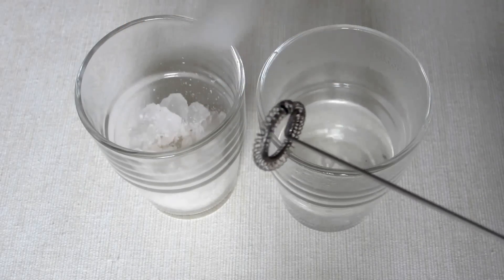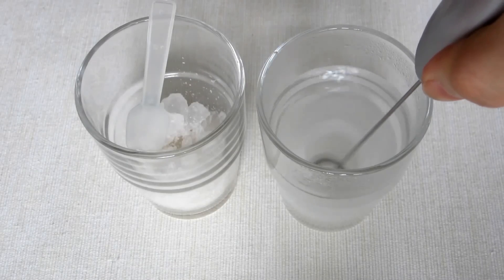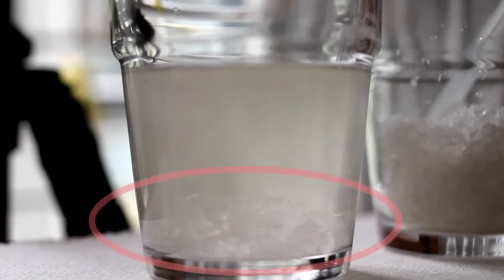By the way, don't add the whole amount into the jar, we are making seed crystal only. Saturated solution is made when you can see some alum at the bottom of the jar.